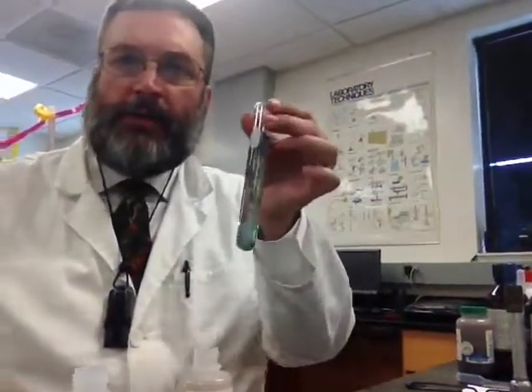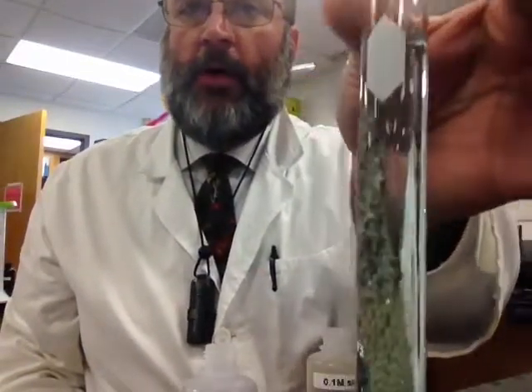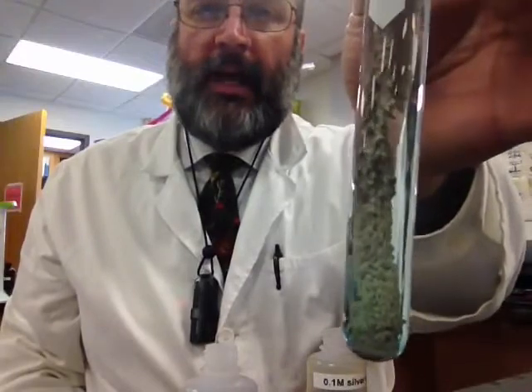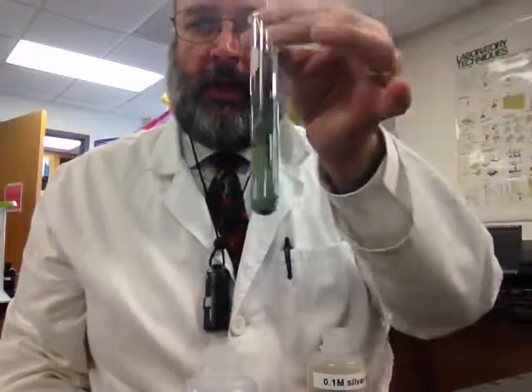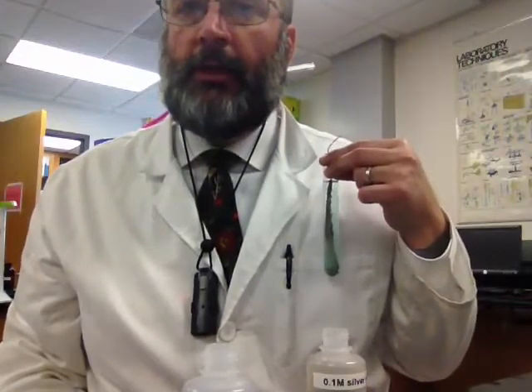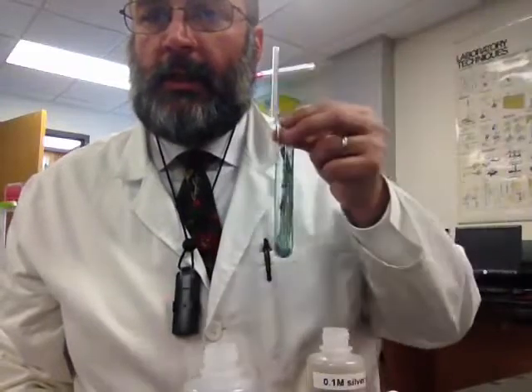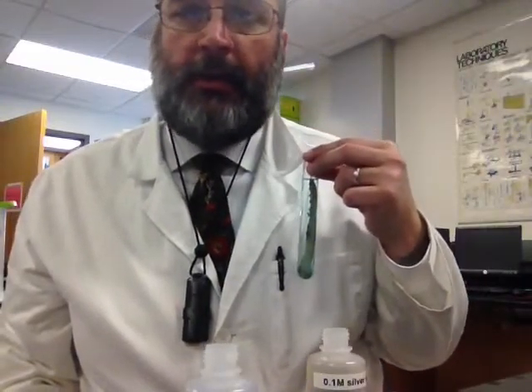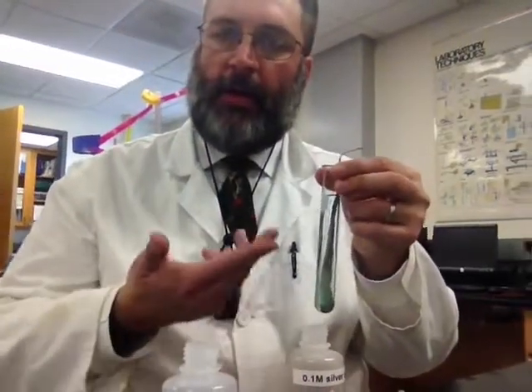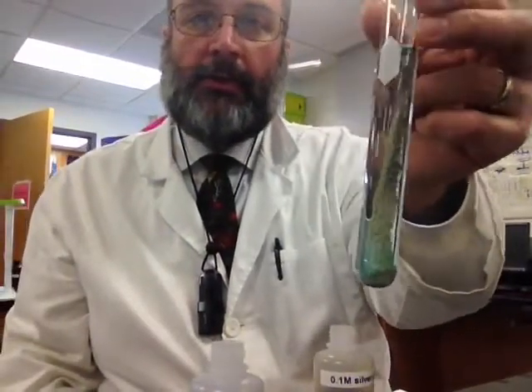So here's one I did yesterday. Okay? You see, the copper wire is now coated with this grayish stuff. And if you look carefully, look at the color next to my white lab coat. Look at the color of the solution. It's not colorless anymore, is it? It's got kind of a bluish cast to it. Well, that tells you something about what's going on in this tube. So this is what that other tube is going to look like in, well, in a day or so. Okay?